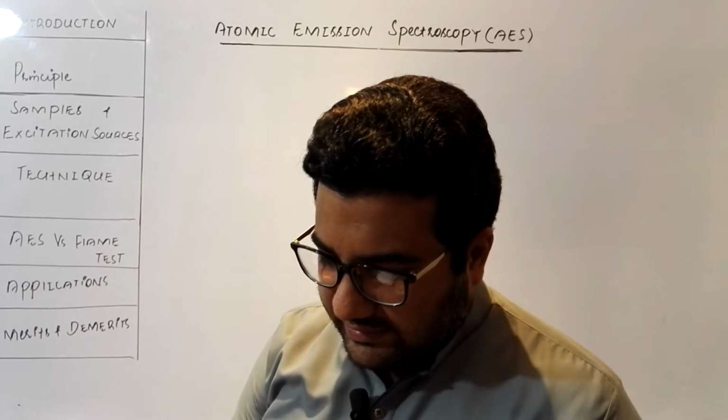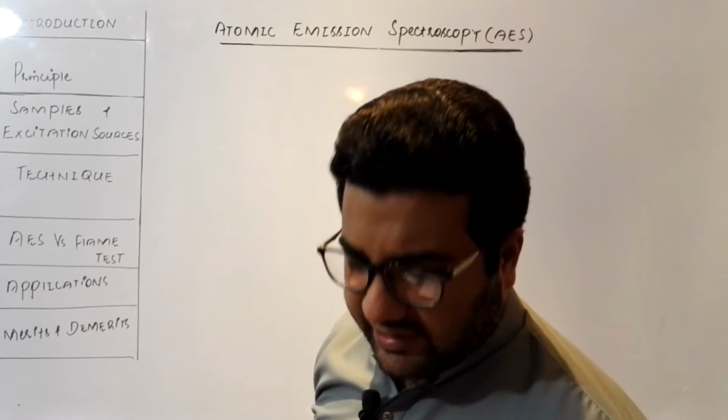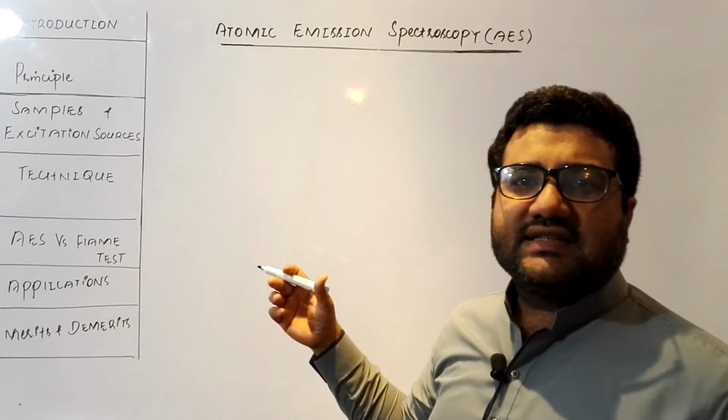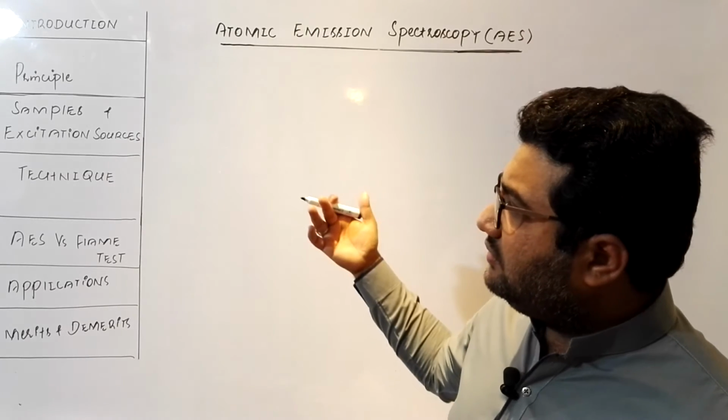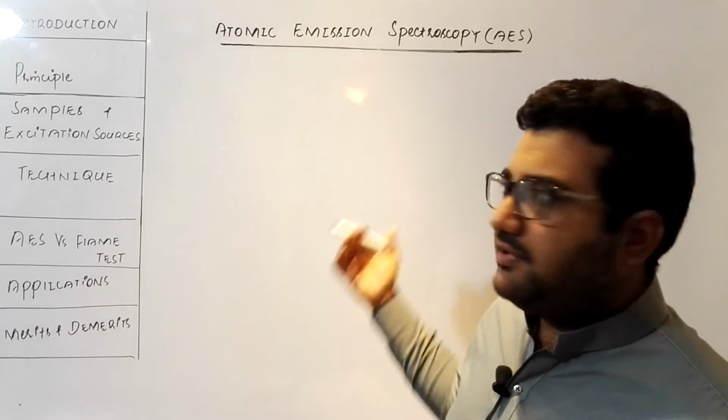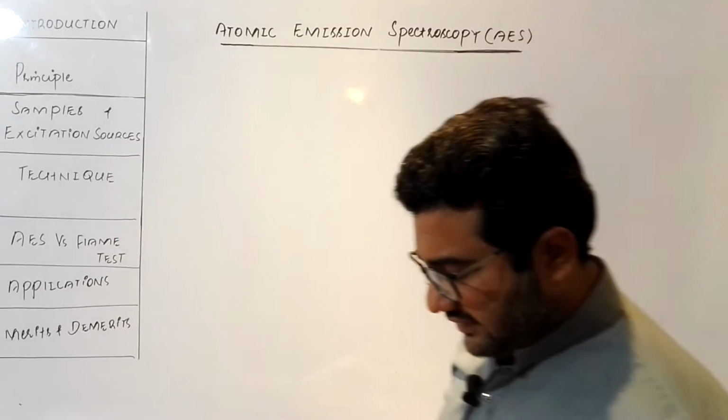That is the technique. Now what technique is used? I am just making a schematic diagram in front of you to clear this concept of how atomic emission spectroscopy works, or how an atomic emission spectrometer works.